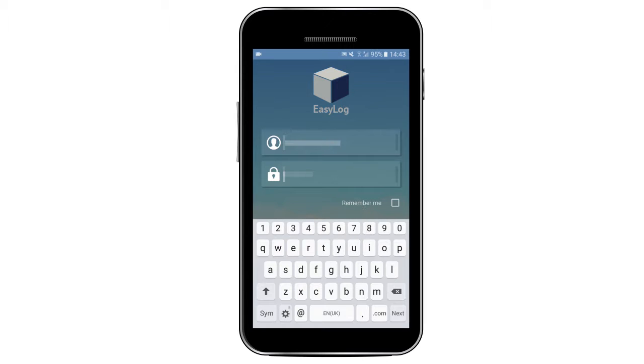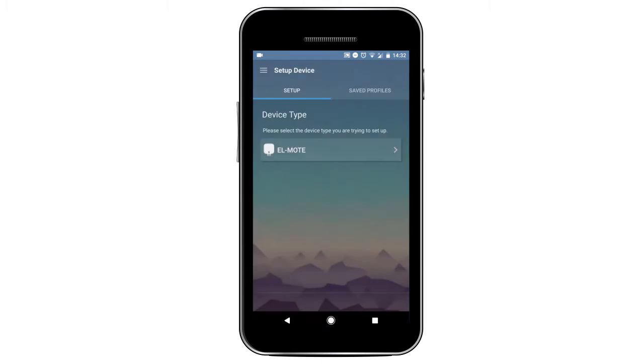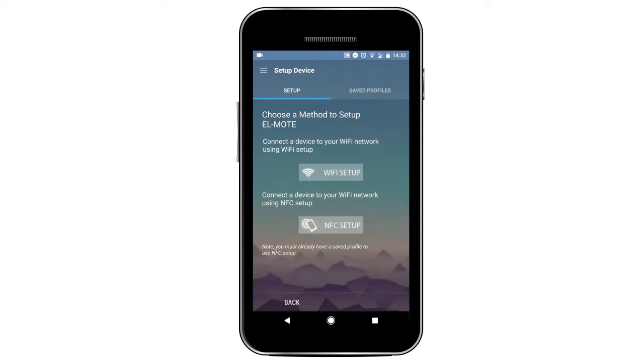Open your brand new app and log in with your Cloud ID. In the menu sidebar, click Setup Device and select EL Mote.